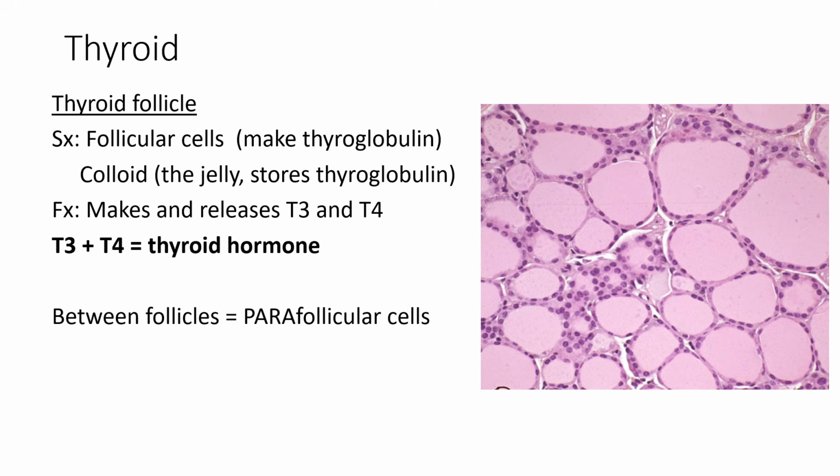They release a hormone that has a function that is completely different from T3 and T4. They release calcitonin. Not going to go into physiology today, but calcitonin has to do with regulating your blood calcium. T3 and T4 is regulating the rate of your metabolism. Completely different hormones, and they have completely different pathways for release.